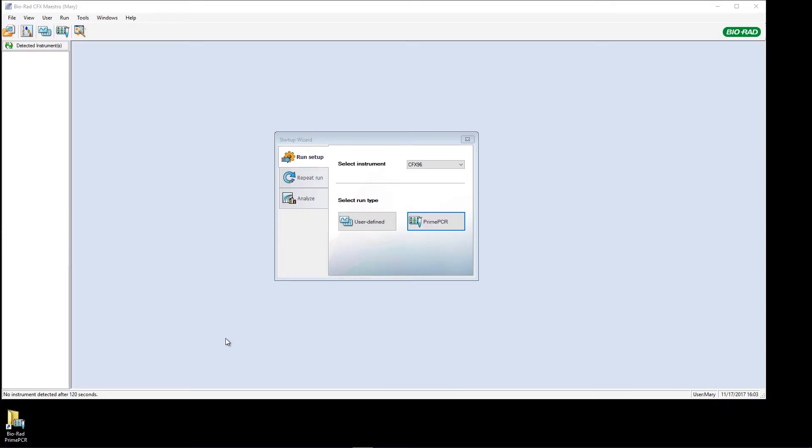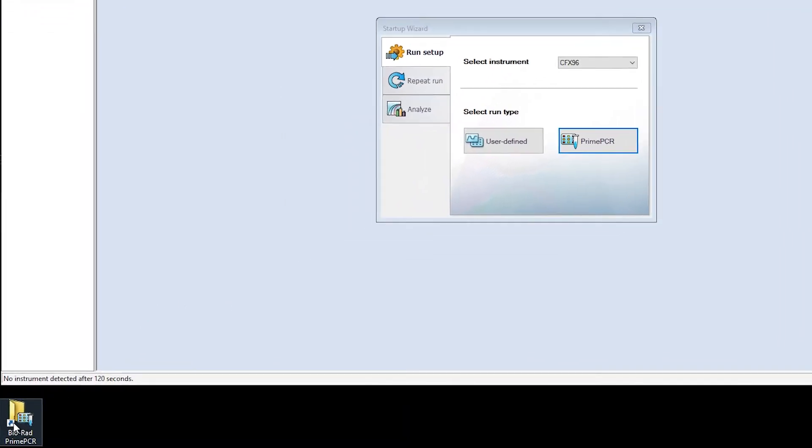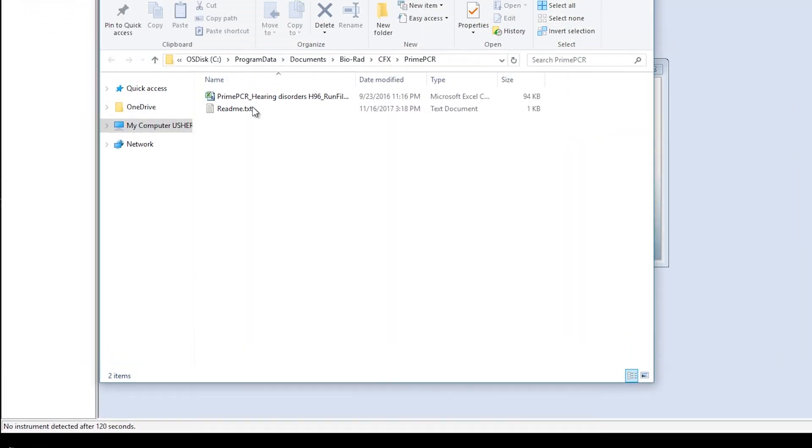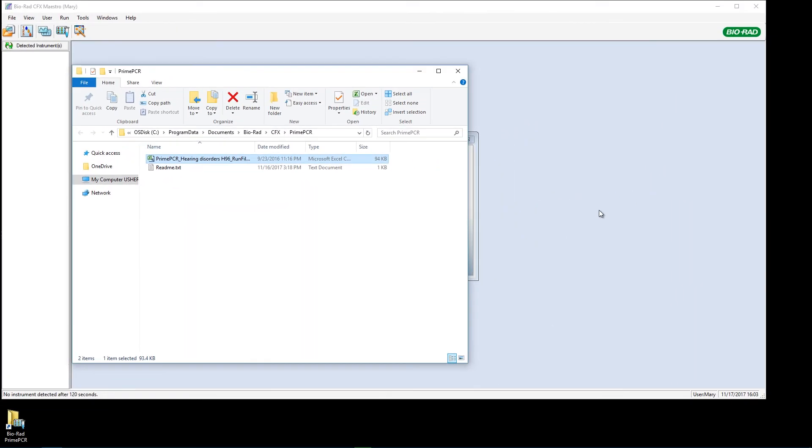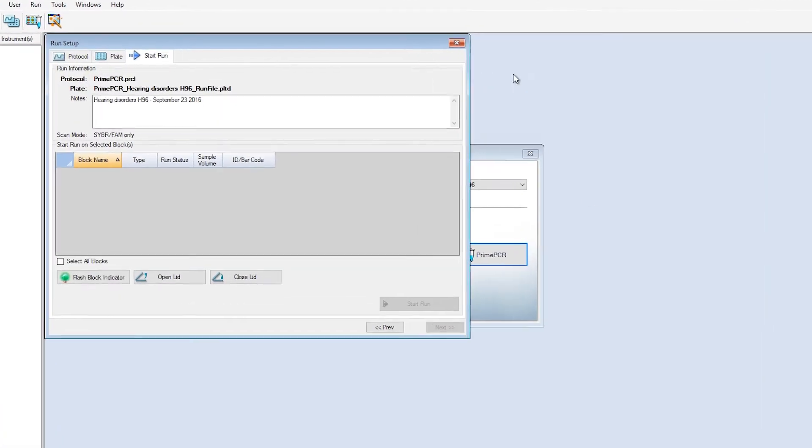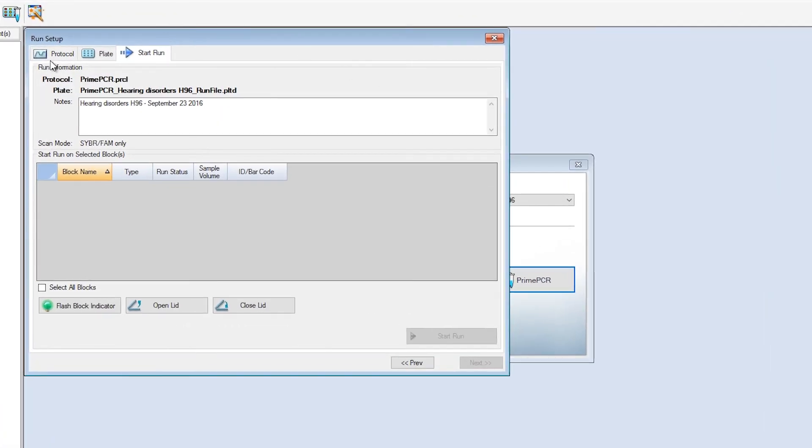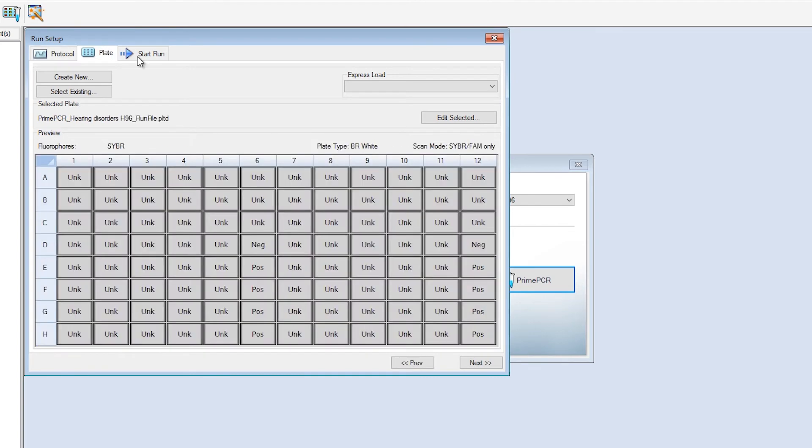Since I'm now running a Prime PCR plate instead of designing my own, I'll just go to the start setup screen in CFX Maestro and find the Prime PCR file on my desktop, drag and drop the file onto the CFX Maestro screen. Instantly, the run conditions are in place and the plate layout template is loaded.